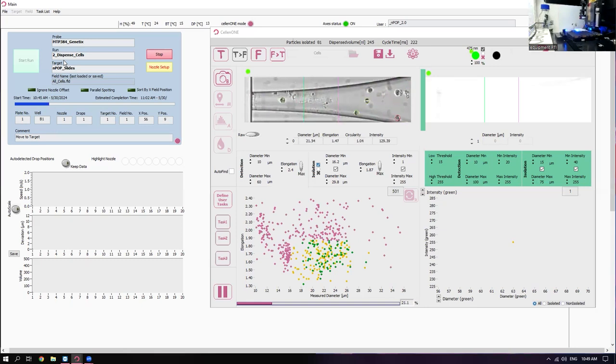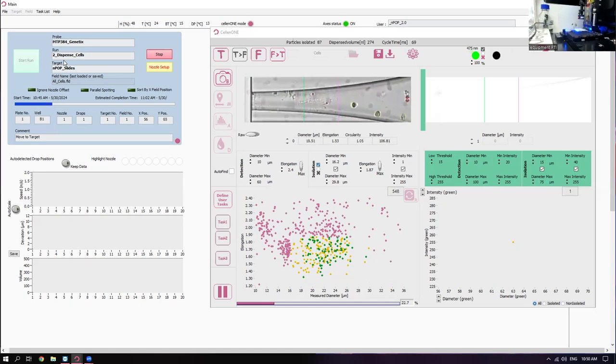There's a setting in there that depends a little bit on your exact setup, how effective the flow is through all the tubing to actually cool those holders. But essentially, we measure temperature and humidity. We control the humidity. And then we also will have this offset from the analyzed dew point to the temperature that we want on the deck.